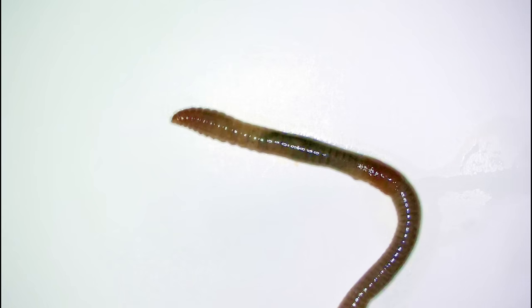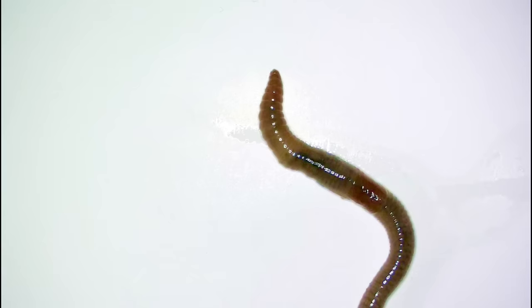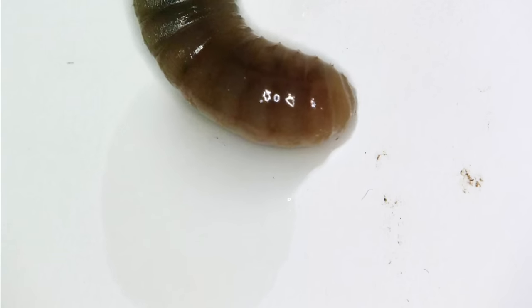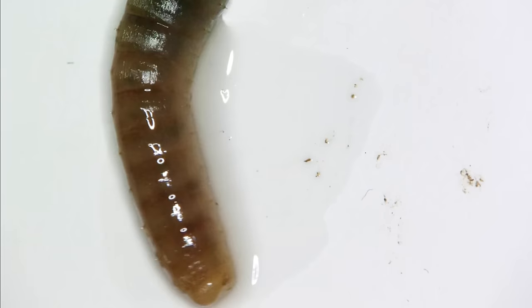So now you can see the earthworm on a more or less pretty dry surface. It's struggling to get around. Especially here you can see it, so I try to give it a little drop of water. And now you can see how the earthworm starts to enjoy this nice and wet environment.